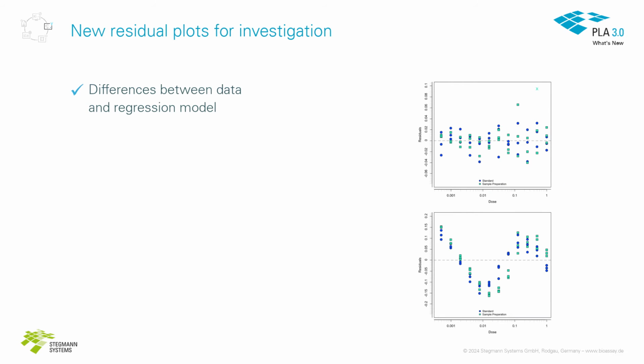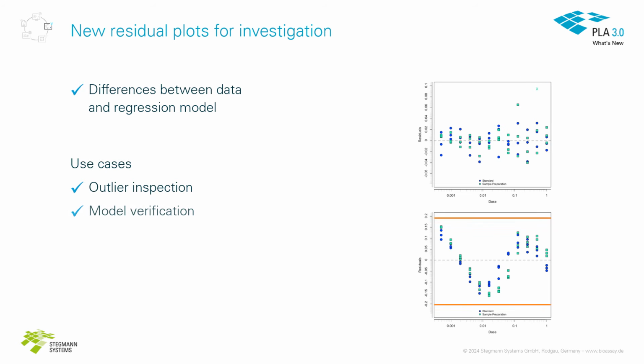Residual plots can reveal differences between assay data and the estimated regression model. For example, they allow you to inspect detected outliers or verify the regression model.